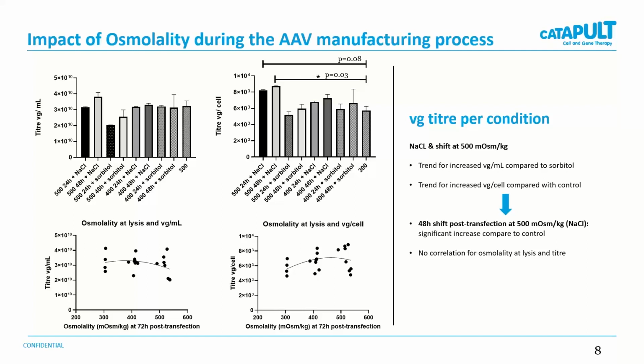Our conclusion for that was there was a significant increase in titer for a shift happening at 48 hours post-transfection at 500 milliosmol using sodium chloride, compared to our control condition.